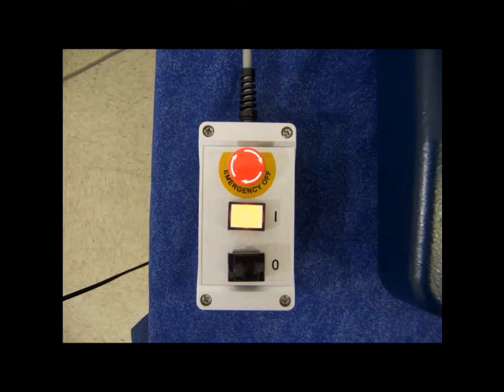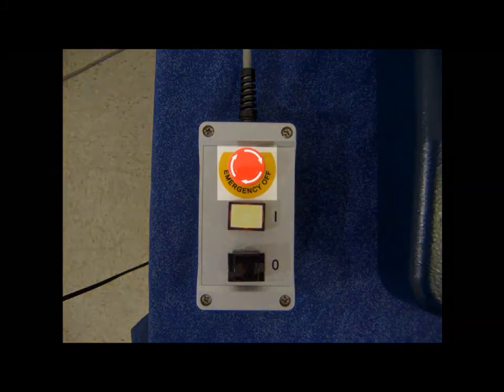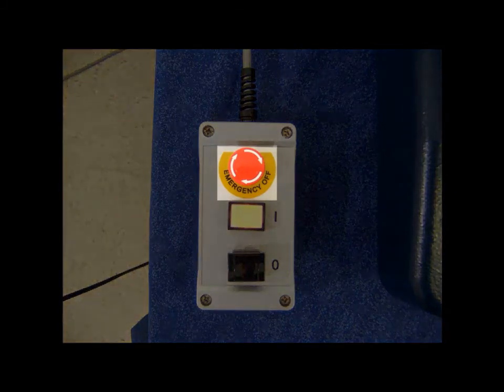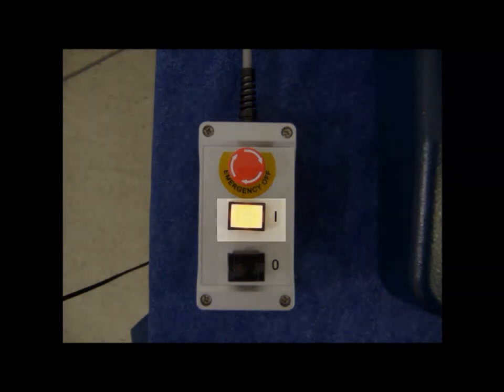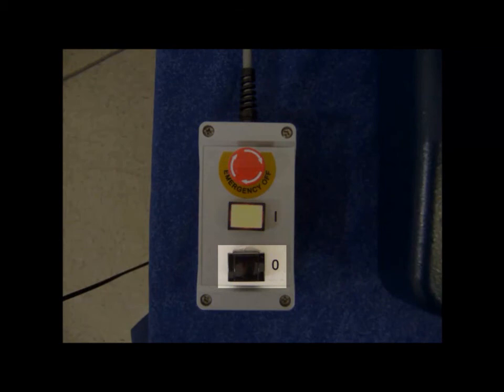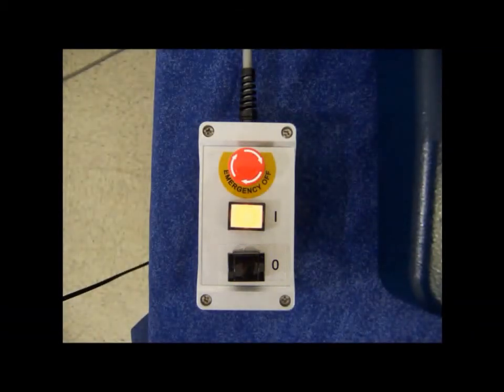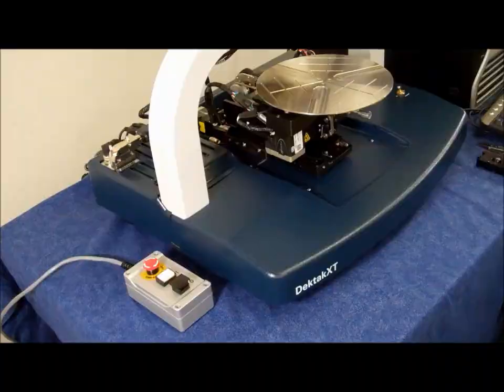The EMO or emergency machine off switch box consists of three buttons: a red EMO button, a white power on button, and a black power off button. The EMO button cuts off power to the DECTAC XT system but leaves power on to the PC and monitor.